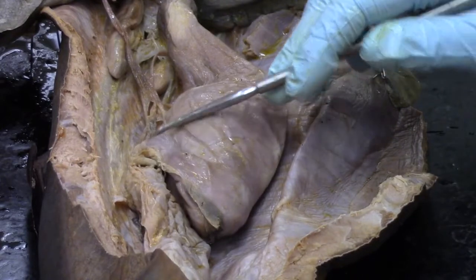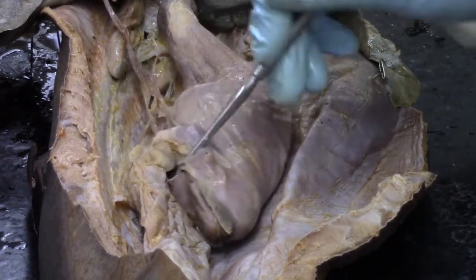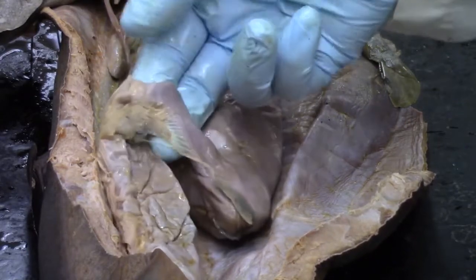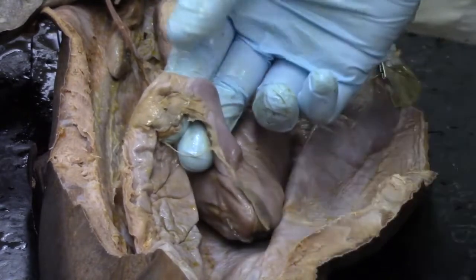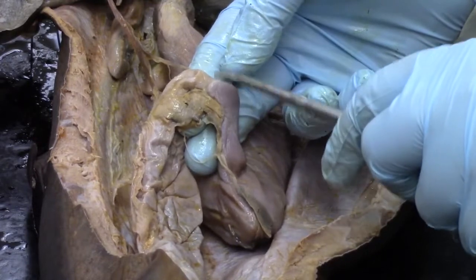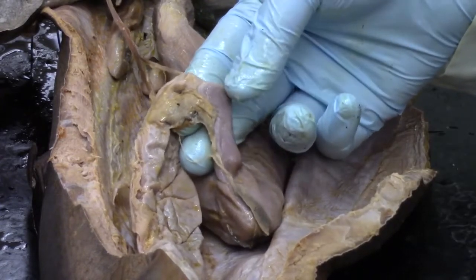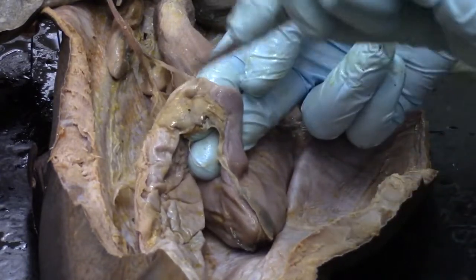And then as we continue along the J, at the tip of the J here, we'll find another piece. Sometimes it helps if I just get my finger in behind there. So we have this piece here. That is the pancreas. We can also really clearly see this narrowing. This is going to be our pyloric sphincter, and that's going to be our transition point between the stomach and the duodenum.